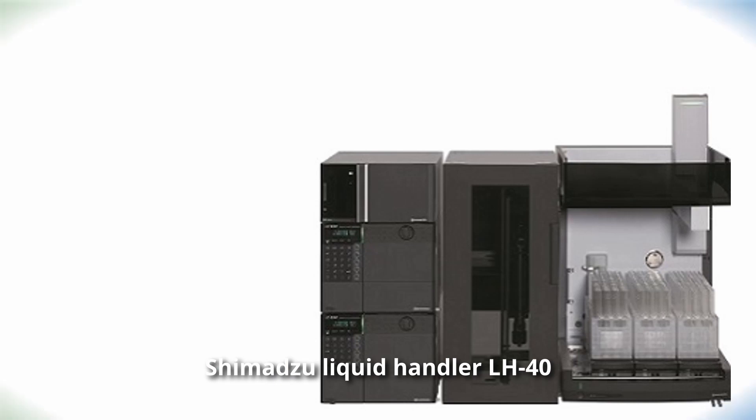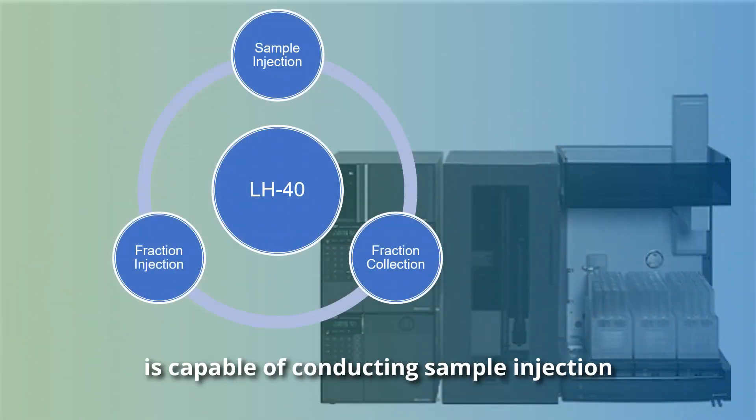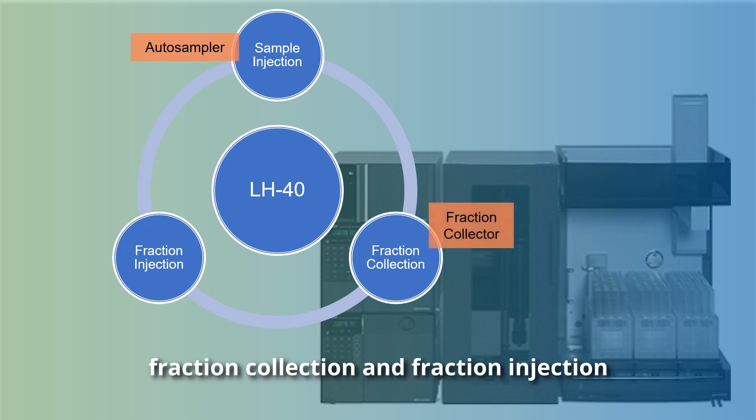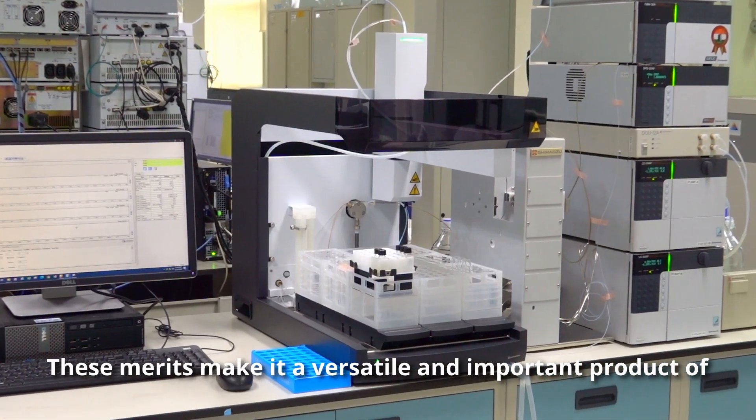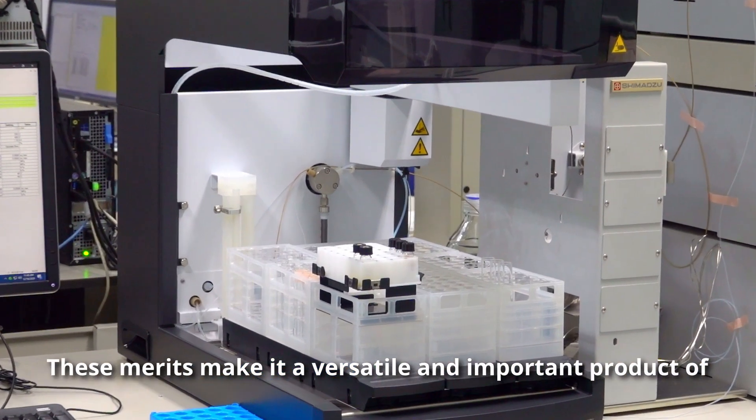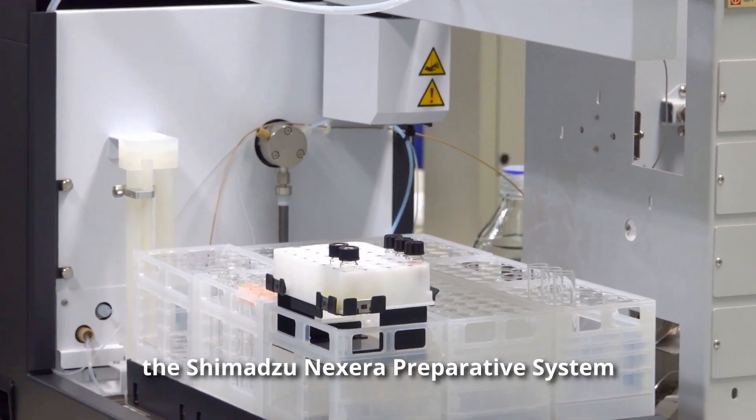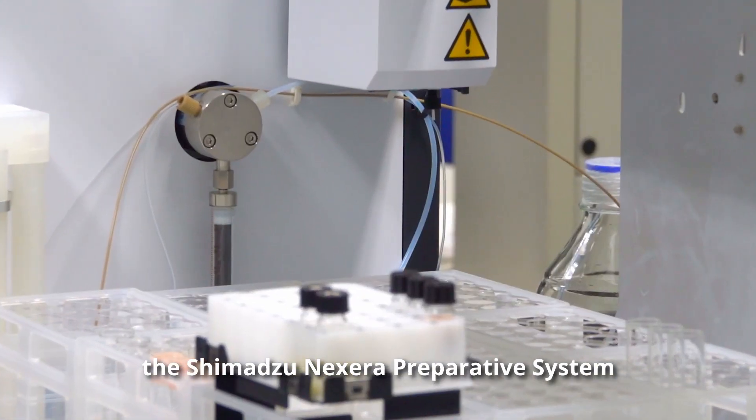Shimadzu Liquid Handler LH40 is capable of conducting sample injection, fraction collection, and fraction injection. These methods make it a versatile and important product of the Shimadzu Nexera Preparative System.